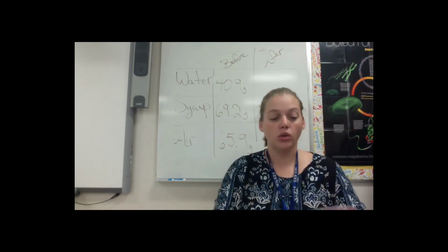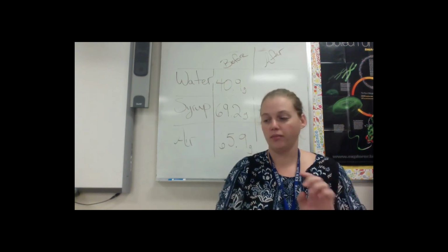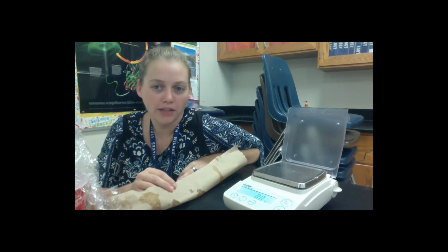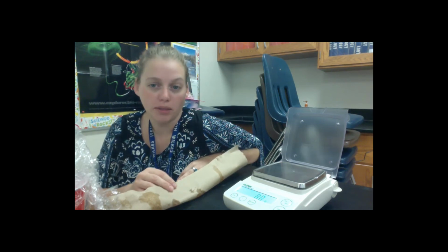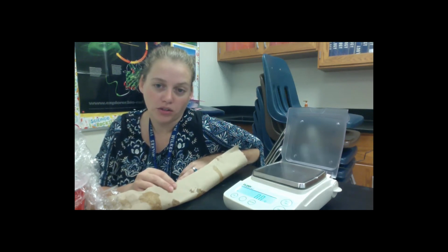Now I'm going to go wash off my syrup egg. I'm going to dry my eggs, and we're going to reweigh them. Please make sure you've written down your hypothesis for today. We were thinking about whether or not this membrane is still able to allow materials to pass through it. So do you think that former water egg that we have now soaked in syrup could have lost mass? And do you think that the former syrup egg that we placed in water could swell back up and gain mass? So if you've not already done so, please make sure that you've written your hypothesis for this part of the lab.